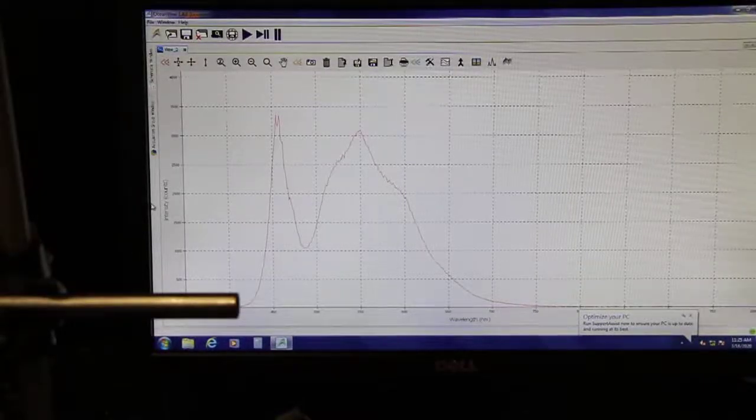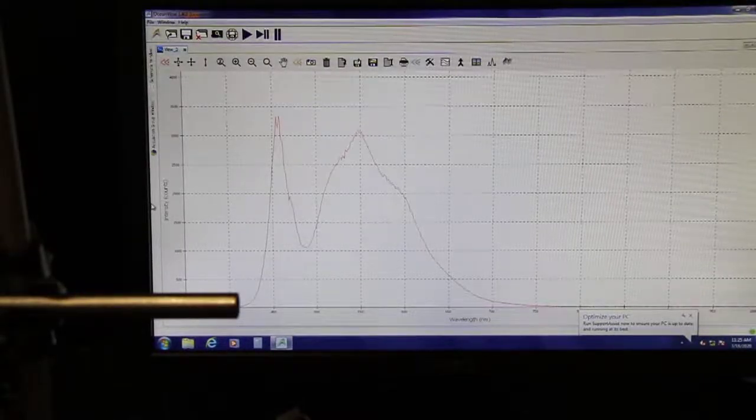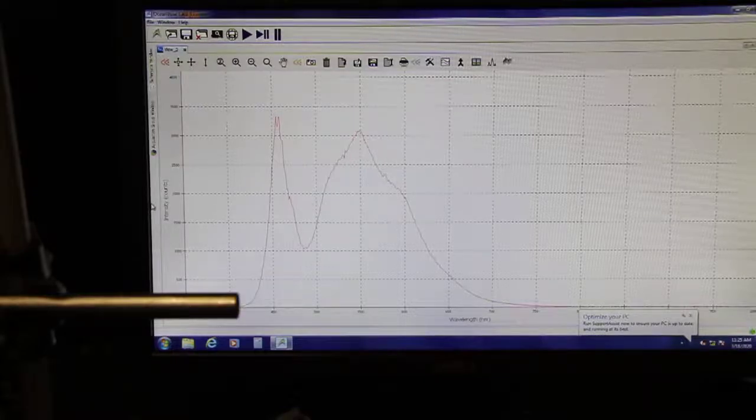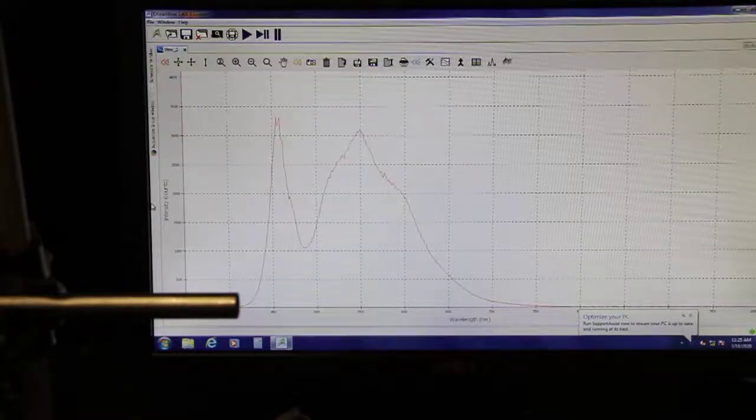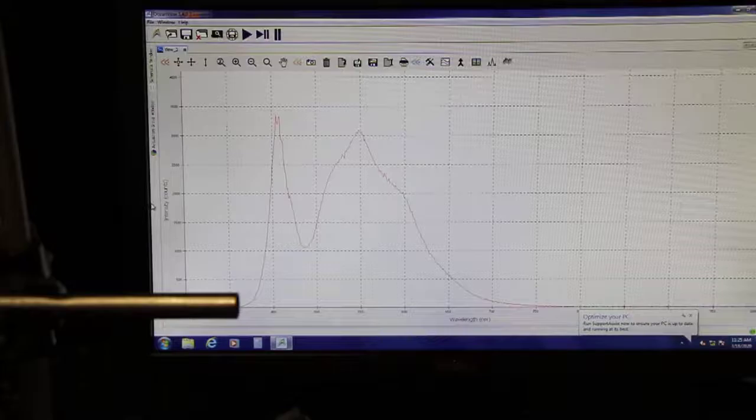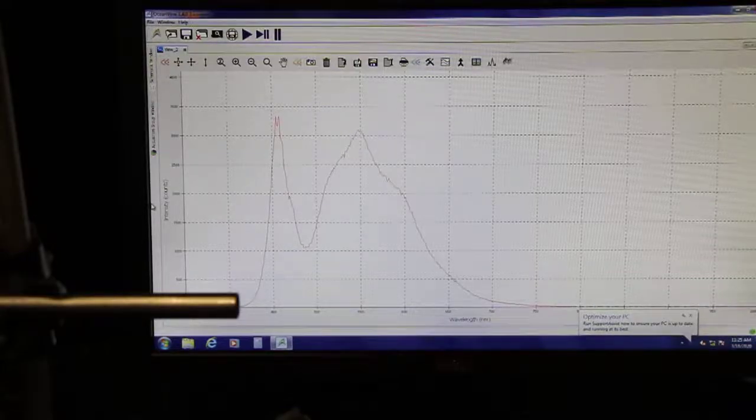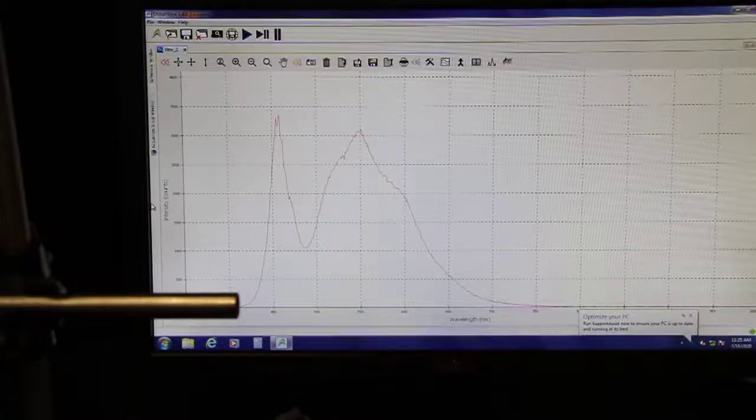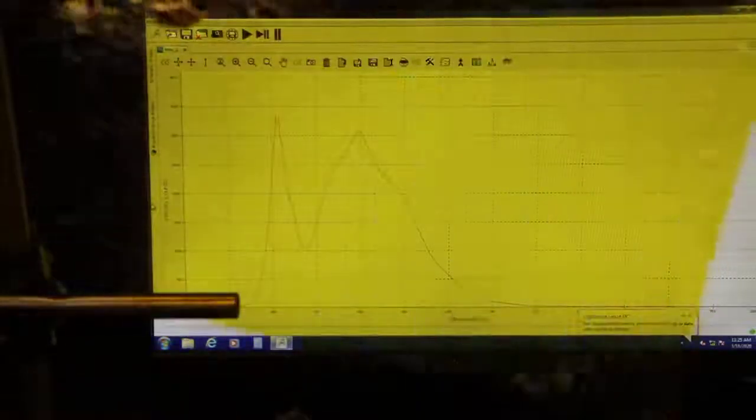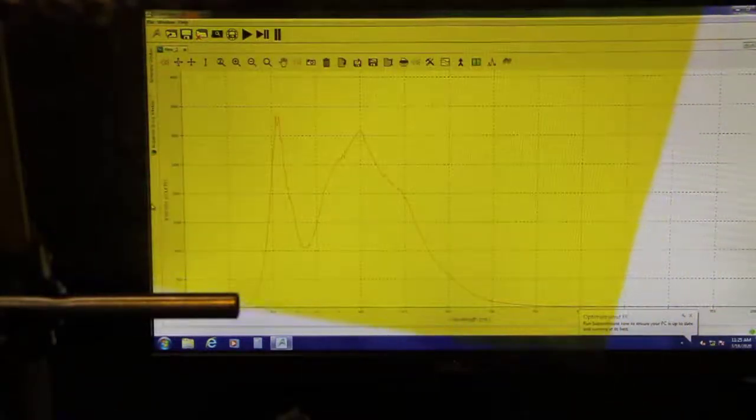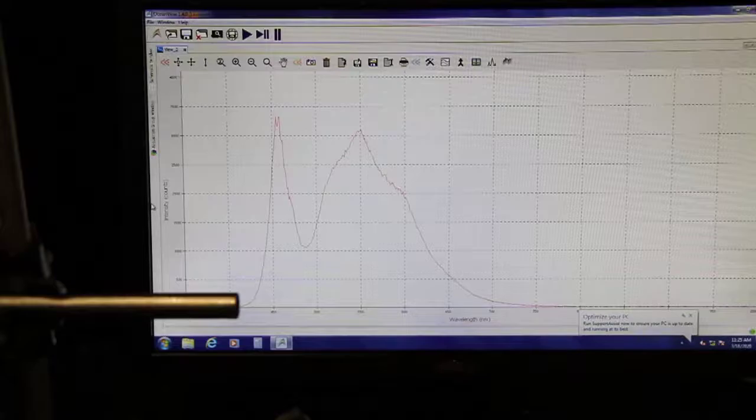Okay, so let's see what we want. First, let's take a look at the spectrum of the yellow piece of cellophane. Look at the spectrum.